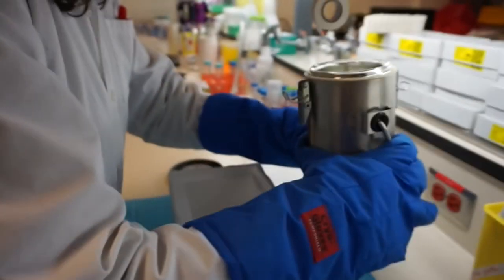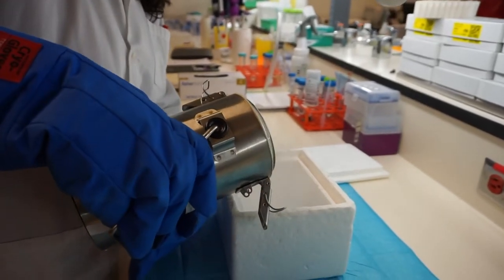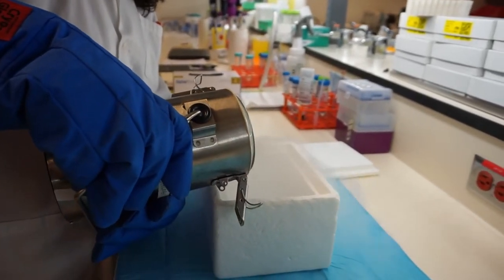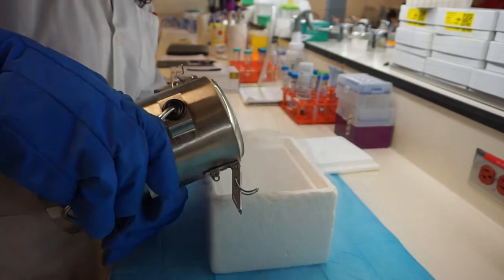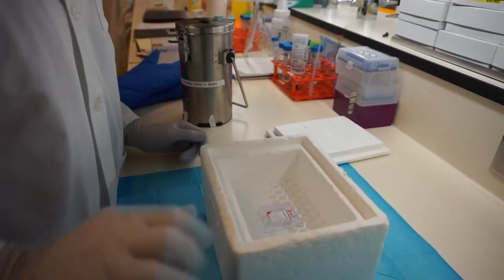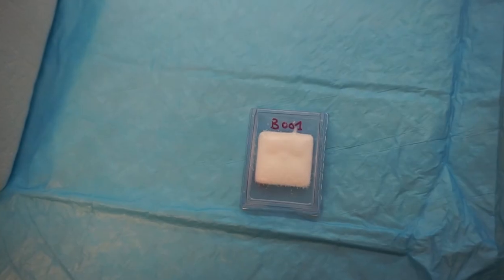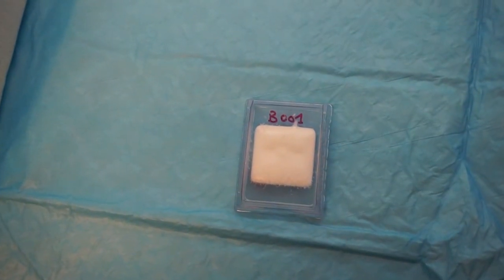Pour liquid nitrogen in a styrofoam box containing a raised grid. Make sure to use the appropriate protection equipment when working with liquid nitrogen. The mould should be laying flat and should be in contact with the gaseous phase of the nitrogen, but not the liquid one. After a few minutes, the block should be frozen and should be completely white.